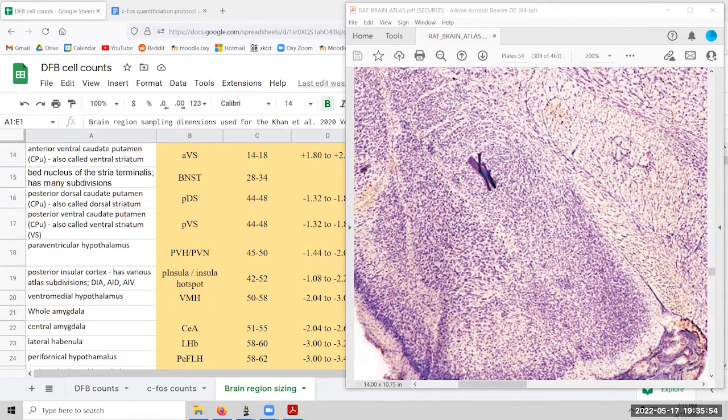Having taken that pause, I'm going to draw the shapes right now. We have the basal lateral amygdala here in this general vicinity. We have the central amygdala here. We have medial amygdala compartments. I'm probably going to have a little bit more trouble trying to draw that stuff, but it's generally going to be throughout here.